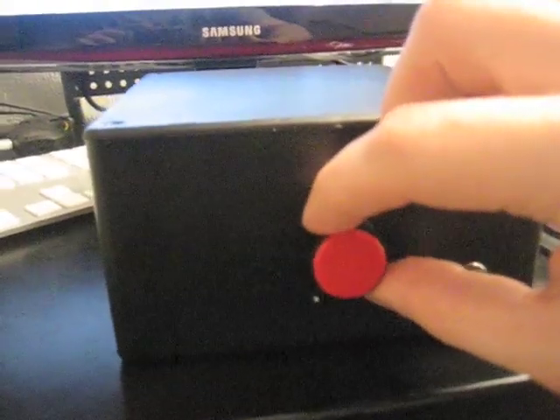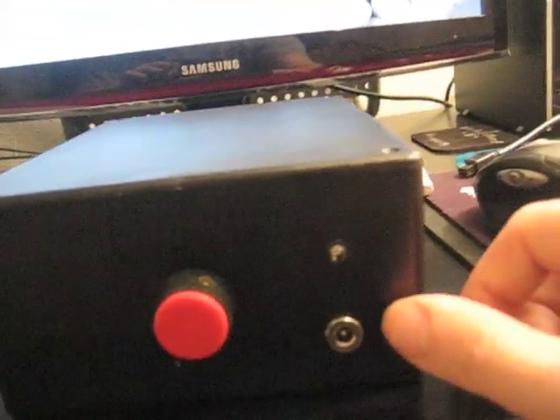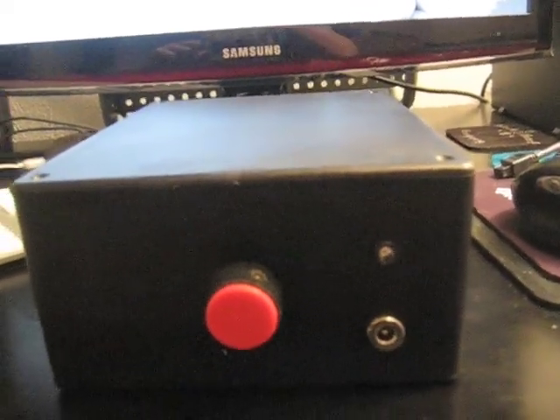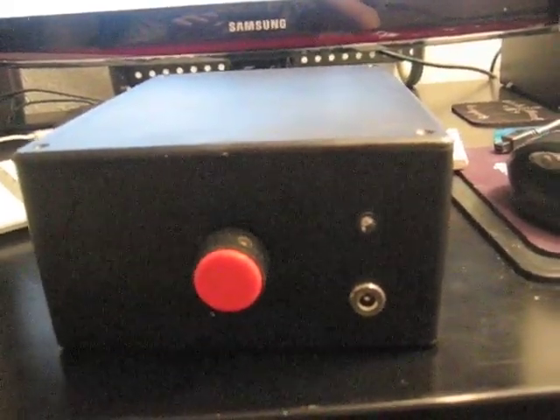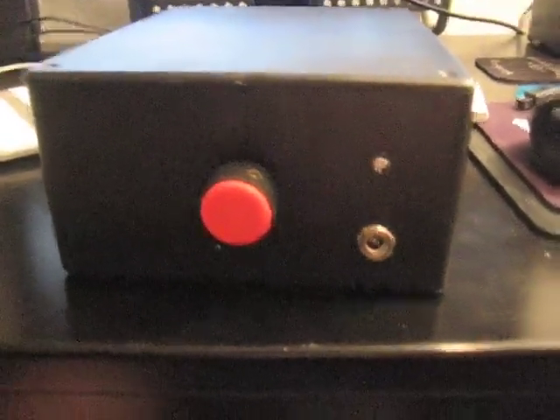Here's my DIY magnetic stirrer made in a fairly large Radio Shack project box. On the front we have a 10K pot with an on-off switch built into it, a power jack to connect it to 9 to 12 volts power, and an LED so that we know that it's on and working.